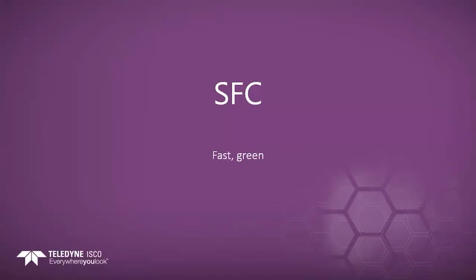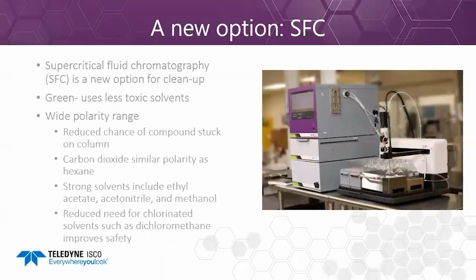SFC is a new technique that can be applied to natural products. The newer systems are very easy to use. It is a normal phase technique, and there are very many columns available for use. As gradients can run from 5 to 70% methanol in carbon dioxide, there is less chance of the compound remaining on the column, and so you are more likely to be successful with the SFC.